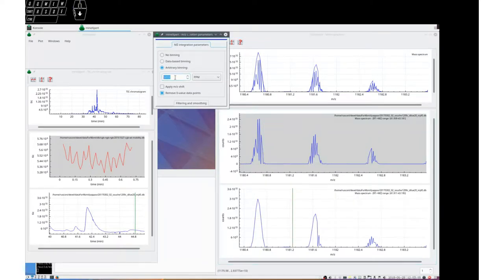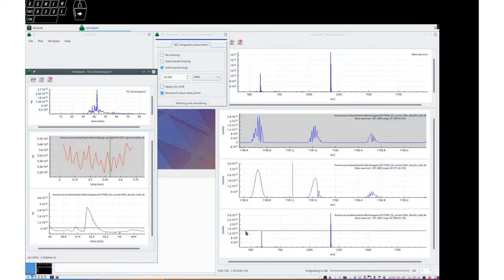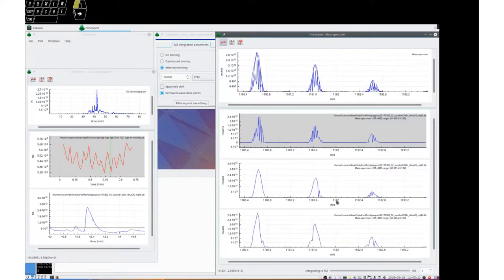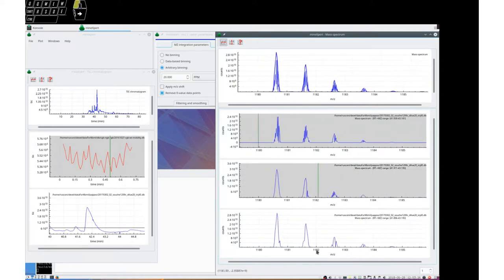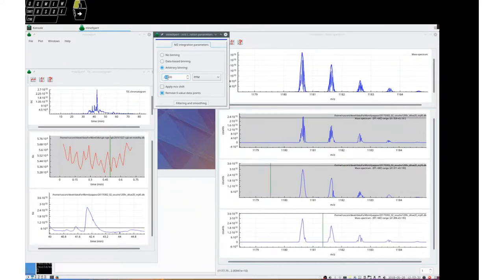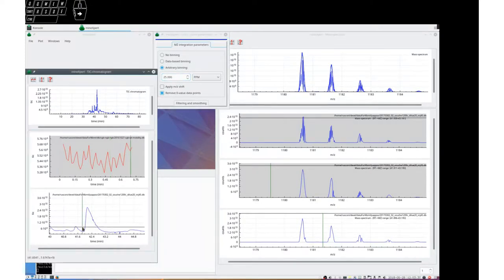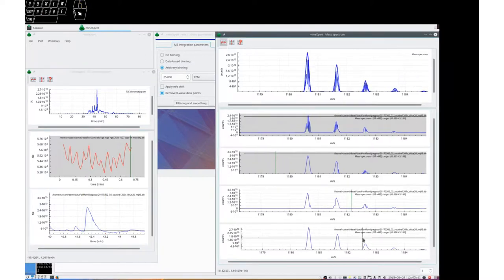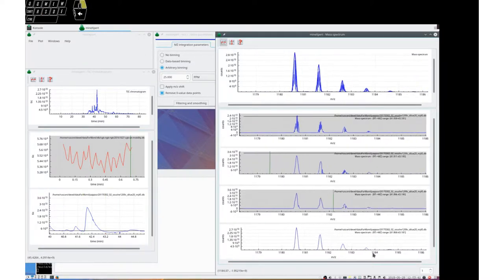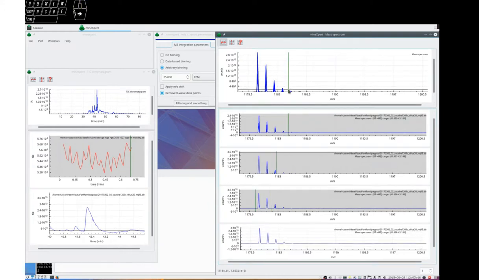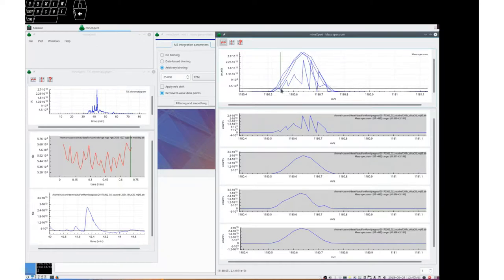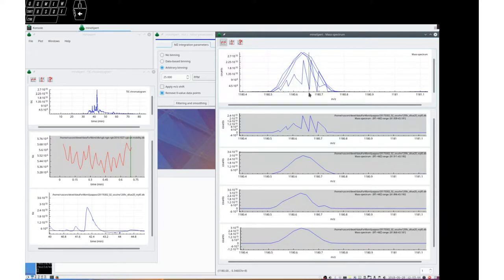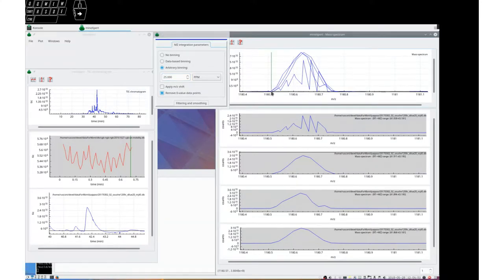Let's do the same integration as before and we'll see it's much better now. We can start reading the spectrum in a reasonable manner. 25 ppm may be exactly what we need. Yes. There we are. So when you look at the data here, what you discover is that we are actually changing the number of bins per MZ unit in this edit box, and that's for the better.